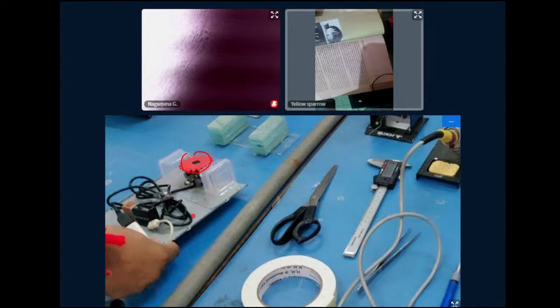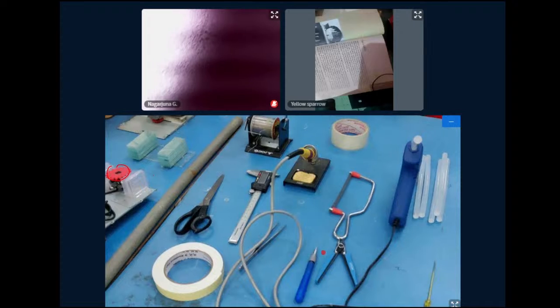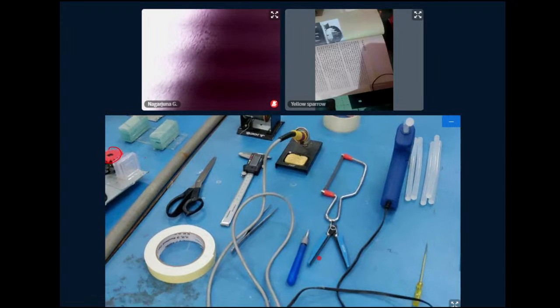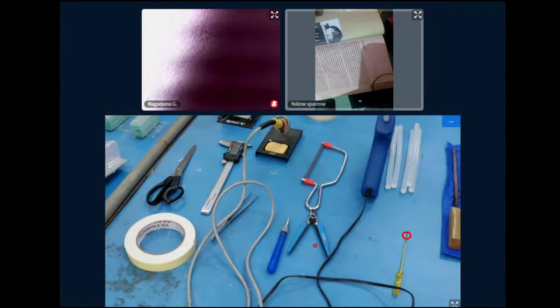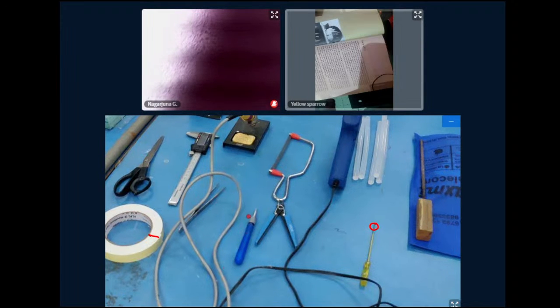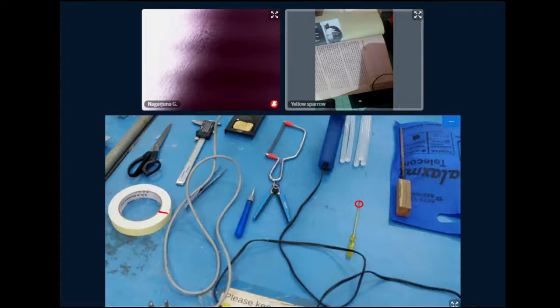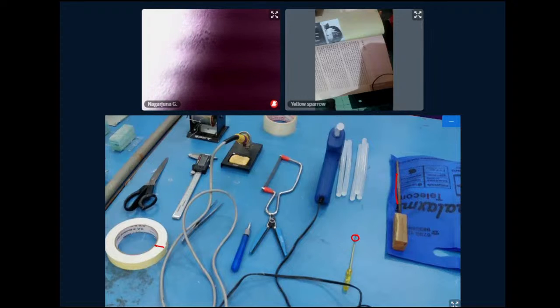All these tools are required at the time of the workshop to open your webcam. You need some soldering, because you are also trying to put some light over there using a USB light. You can see the screwdriver for opening the webcam, the scissor, the tape for making a stage, the glue gun for gluing something, and the file. The file is to shape the gear, so we can adjust its diameter to the diameter of the lens assembly. So all these tools are required, and we kept them on the table and captured the image.